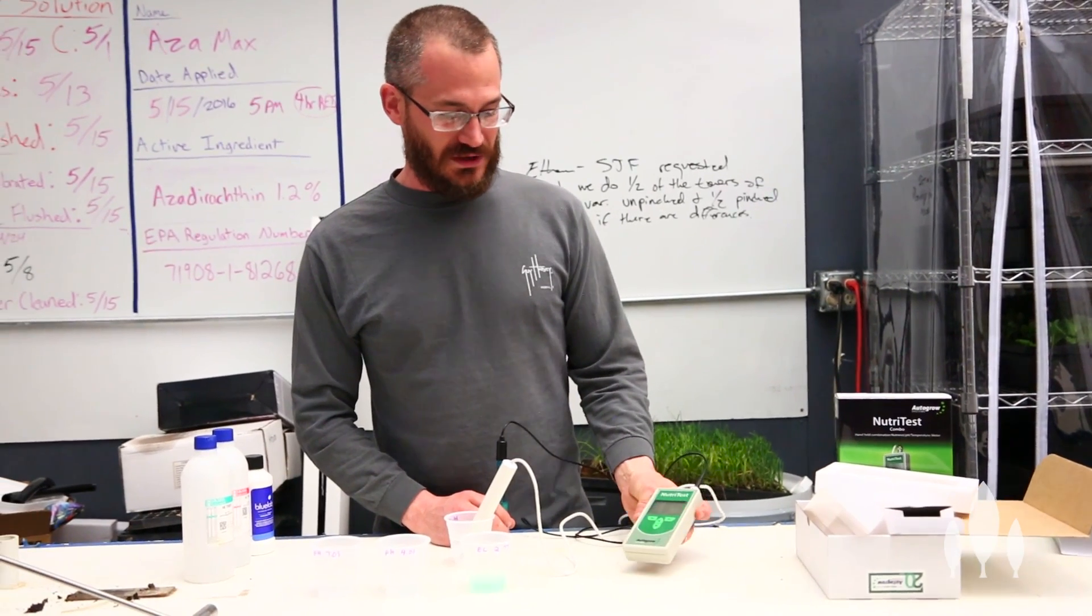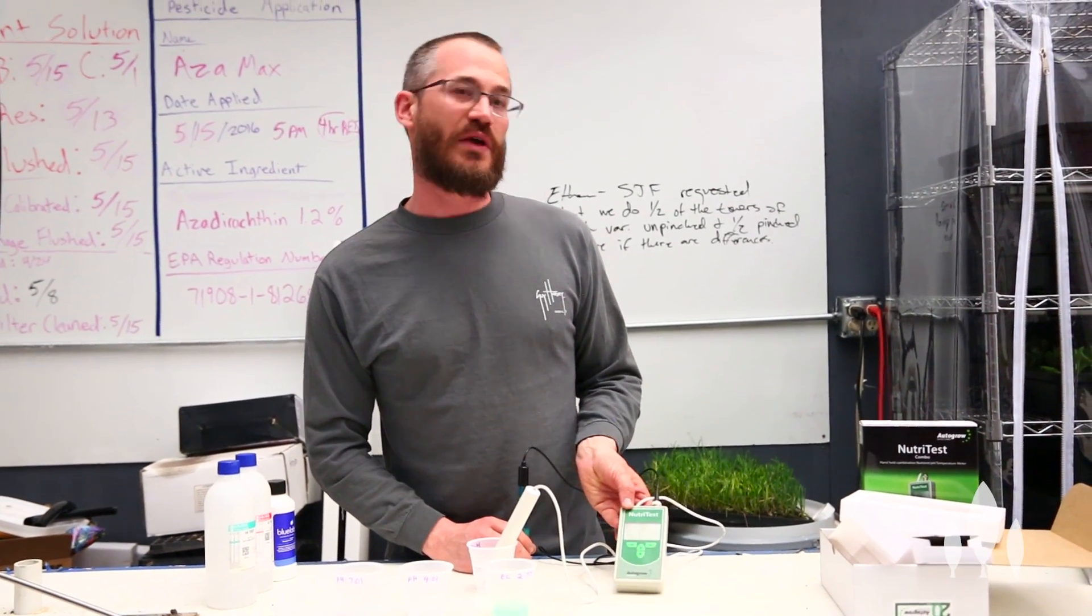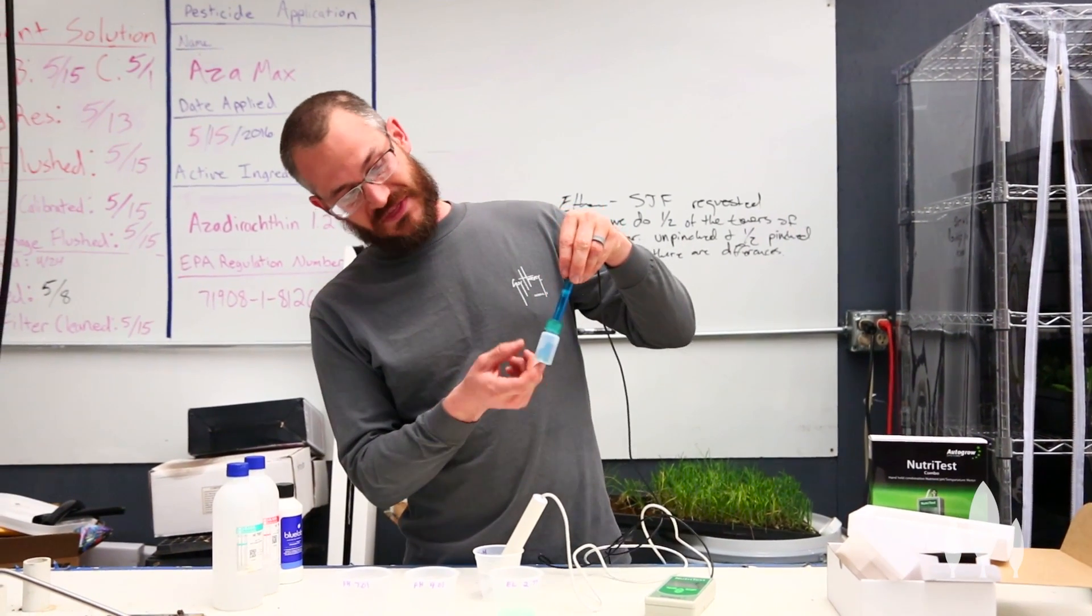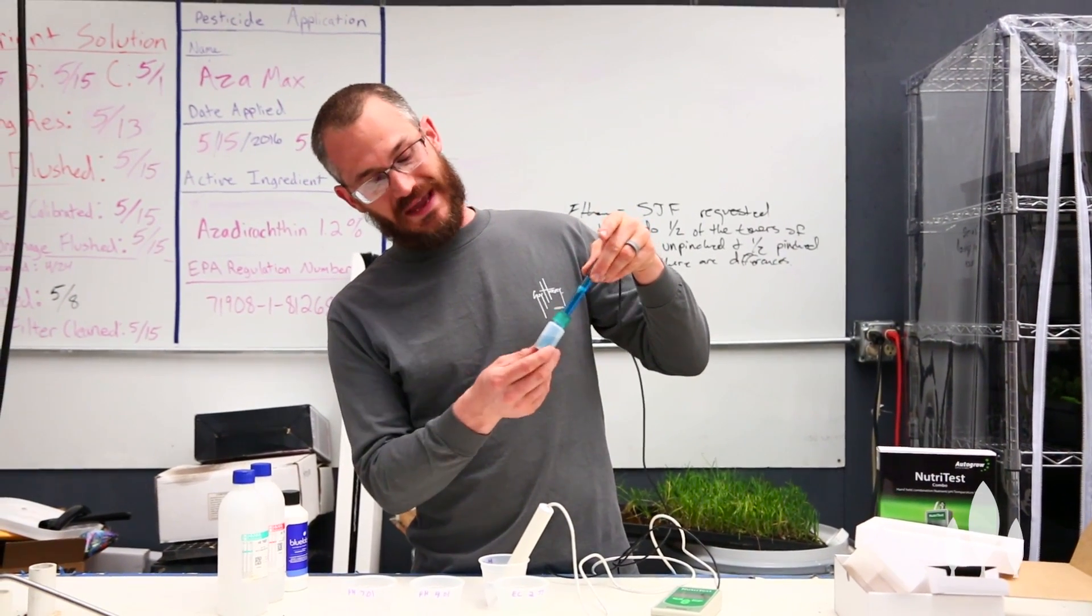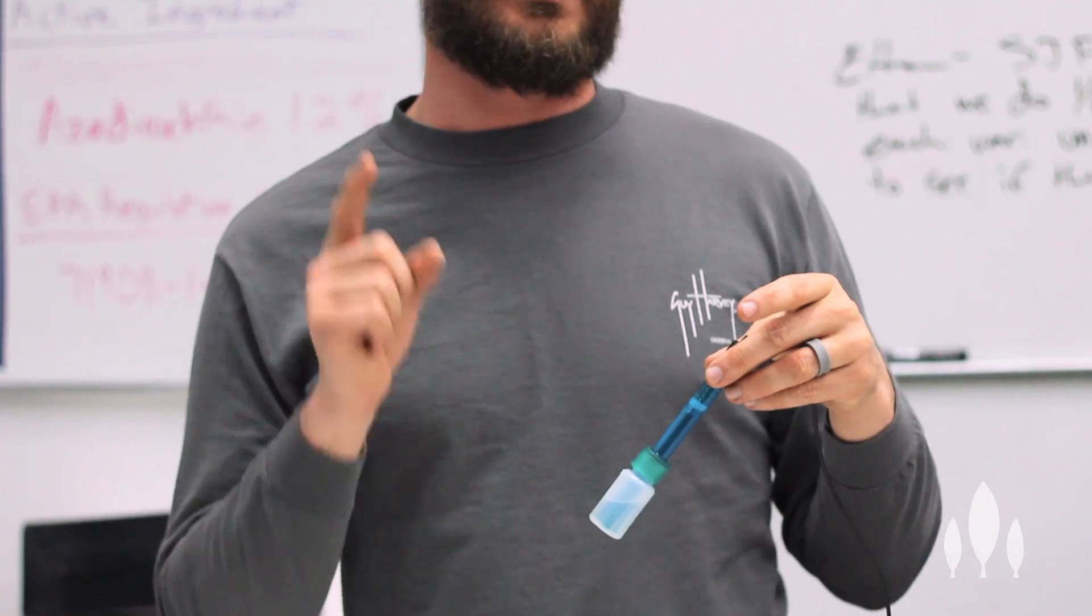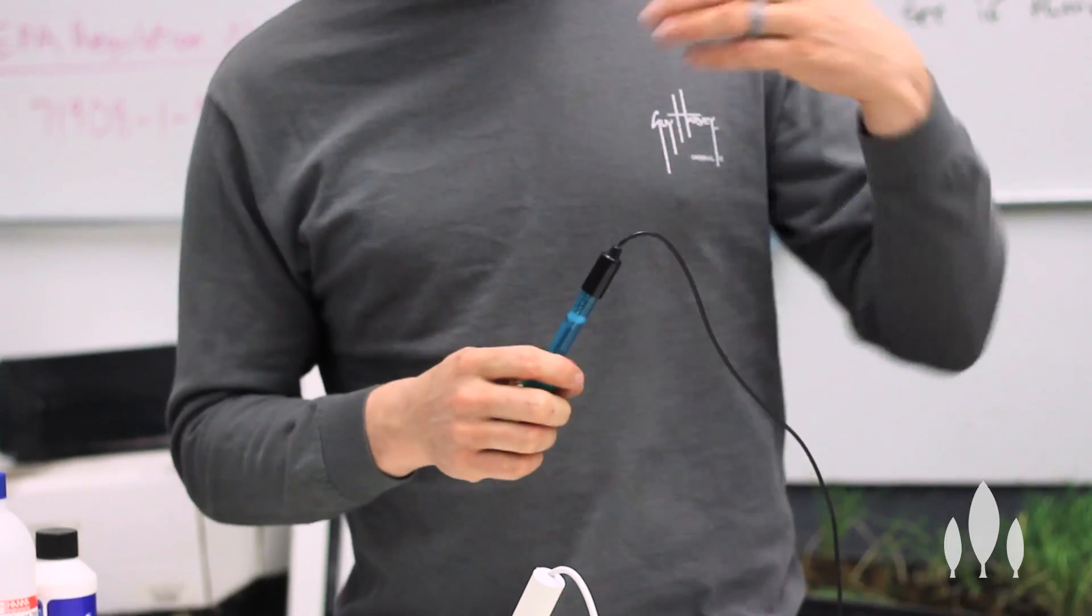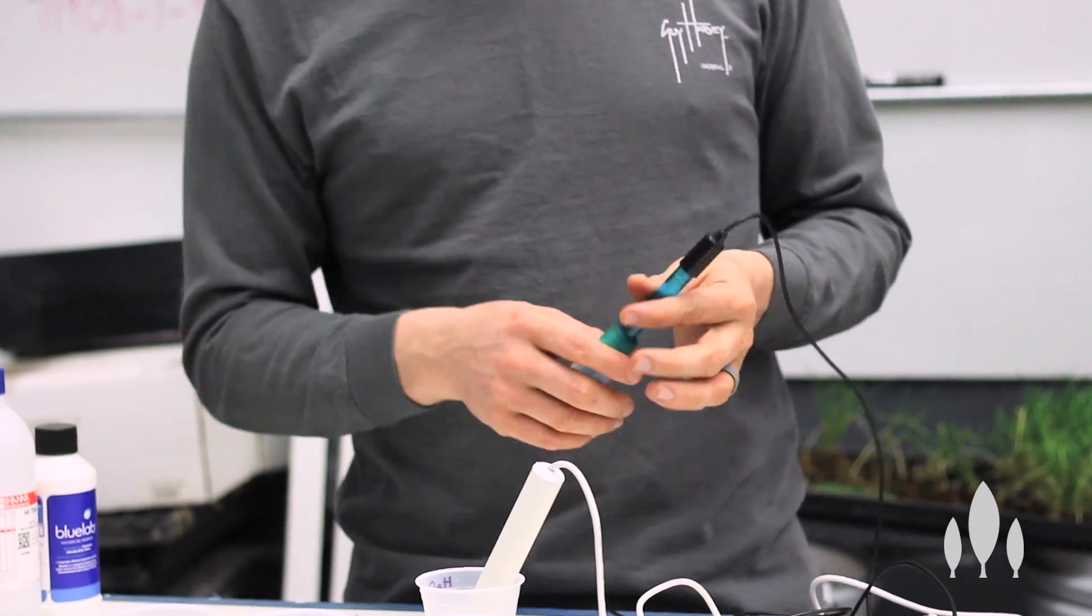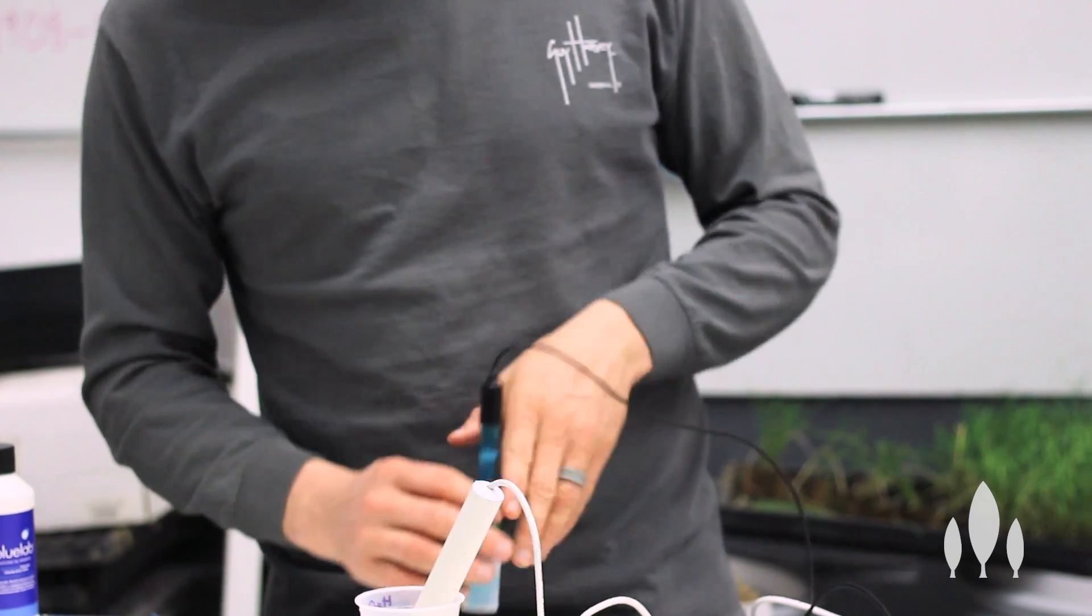And then you're going to start getting readings right out of the gate. And so what you want to do with this is, to start, you want to calibrate it. So, these probes, they'll come like this. This pH probe will be in a little vial of solution. That's because it cannot dry out. You cannot let your pH probe dry out. If it dries out, it gets ruined. It won't ever measure correctly again. You're going to have to throw it away and buy a new $50 probe or what have you.